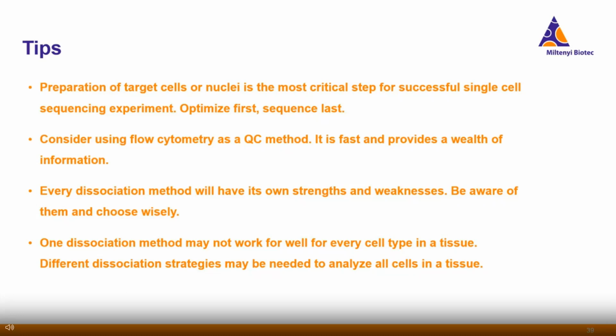Every dissociation method will have its own strengths and weaknesses. Try to be aware of them and then choose wisely based on your tissue type, experimental needs, and cell types of interest. And then, of course, one dissociation method may not work well for every cell type in a tissue. Just be prepared that you might need different dissociation strategies if you want to analyze all cells in the same tissue.